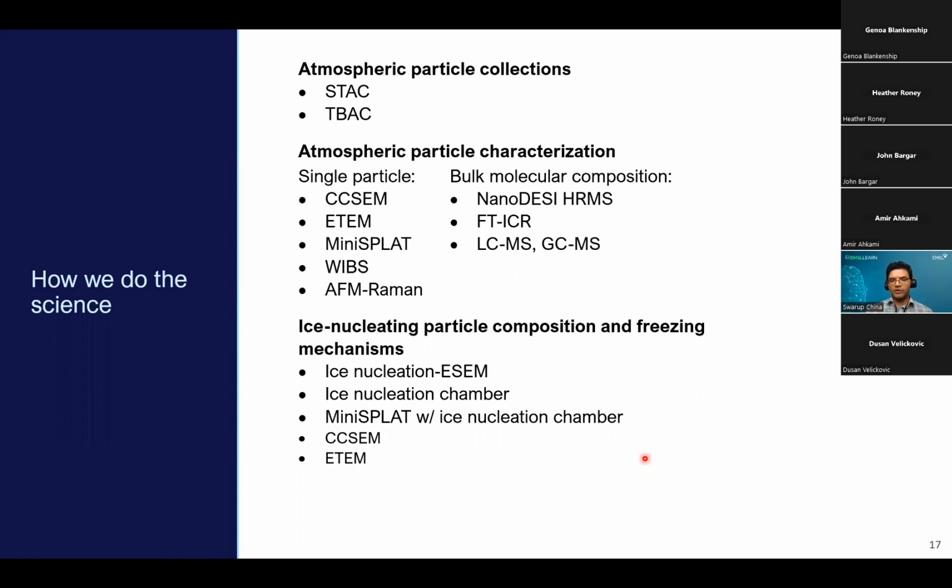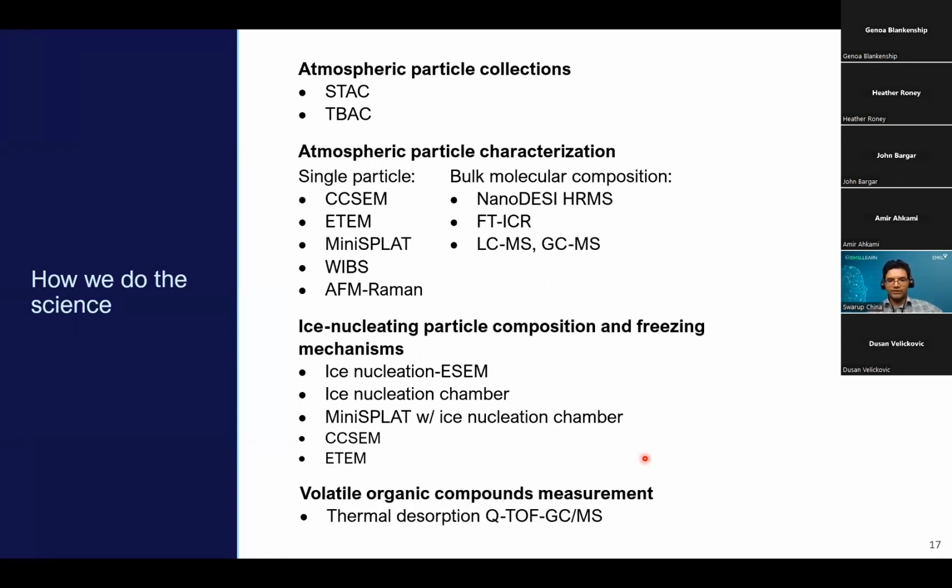And then you can also separate out those crystals and deposit them on a substrate where you can look at the morphology and the chemical composition with different types of electron microscopy. So this is all I have. So far we have been talking about how these atmospheric particles or gases are emitted into the atmosphere, but when we look below ground, these processes also affect the emission of these particles. So that's what Amir was going to talk about in his next IRP.